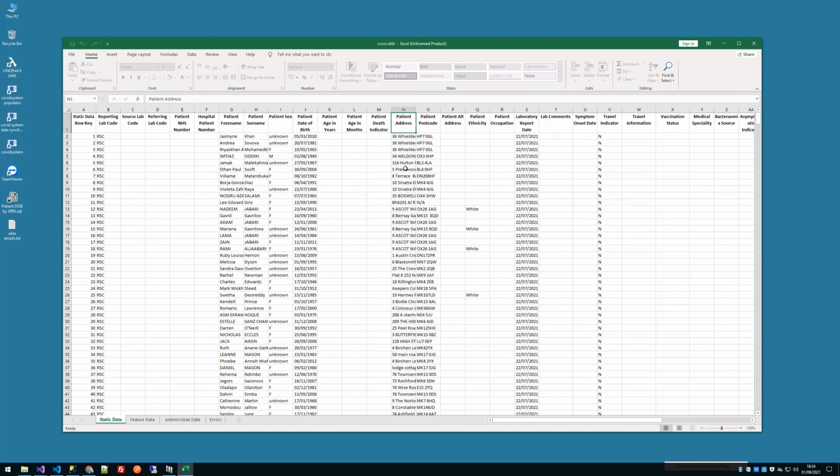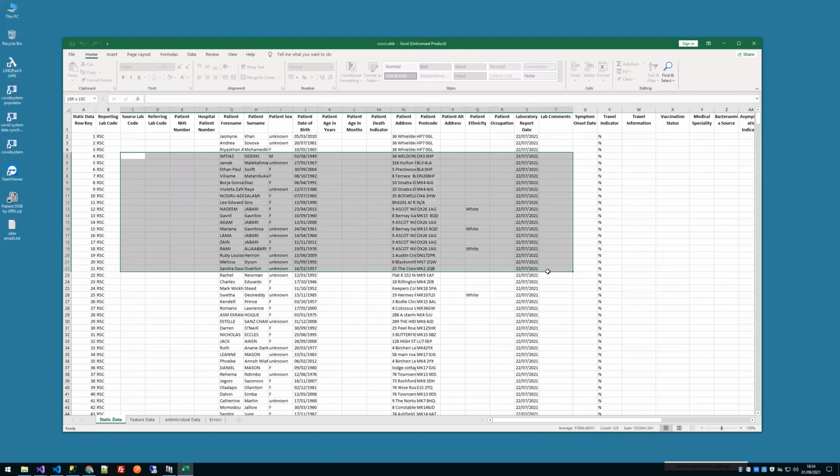Yeah, they accept emails, but you have to create some sort of key. I don't have any IT background, but it's something like creating some sort of key and then sending it through a secure channel. Yes, that's outstanding at the moment. He said he needs to get up and running. It's a sort of incremental release, this sort of stuff that I'm working on. He said, I've got bigger priorities. He goes, yes, this is important, but I can just email them for now, and that's enough for me.